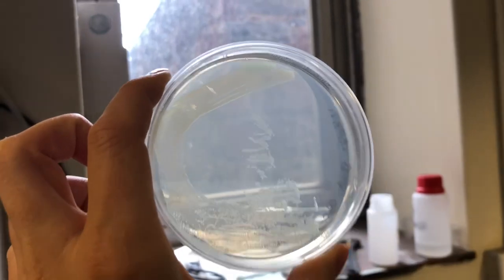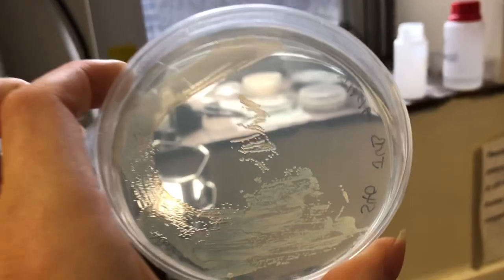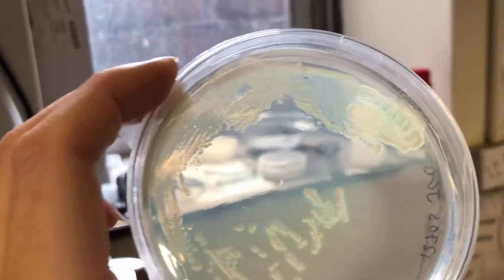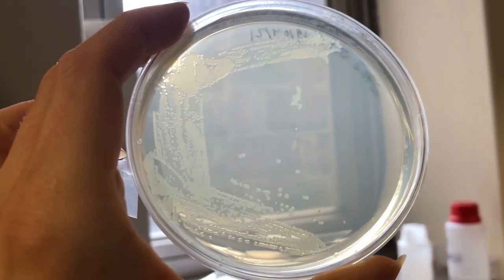I plated up some of my bacteria and left them overnight to grow in a 28 degree incubator, just to make sure they weren't contaminated — only seeing one type of bacteria on each of my plates. They looked fantastic; I was so happy, so I thought I would just show you because I was very pleased at how they turned out.